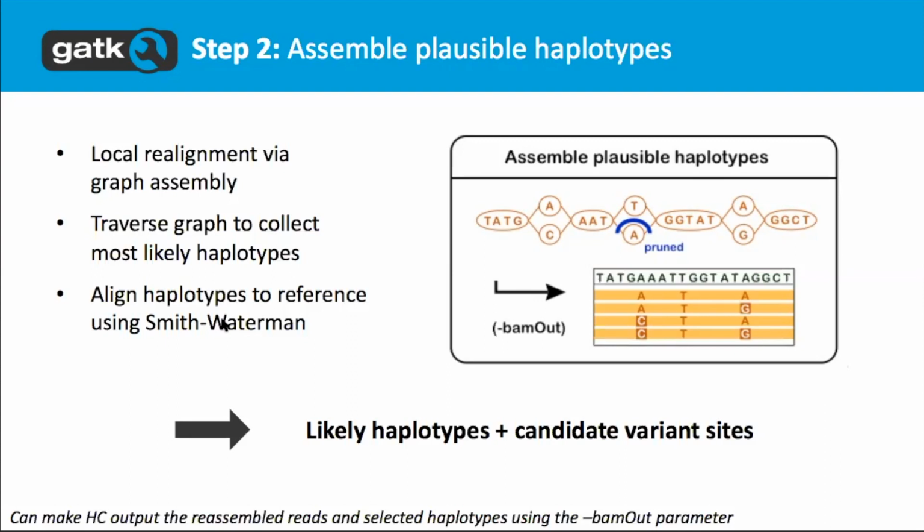And the problem is when you have a single reference and you have a large insertion, the gap penalties are going to add up to the point that the mapper is going to say, forget about it. This is not aligning, and that's where I'm putting in a soft clip. And that's your problem.